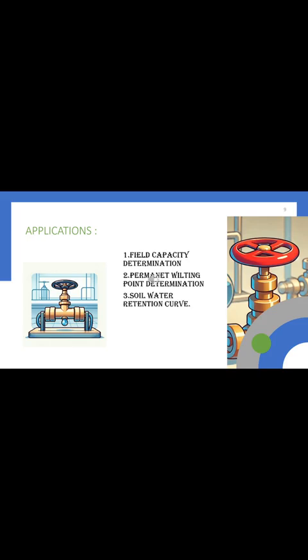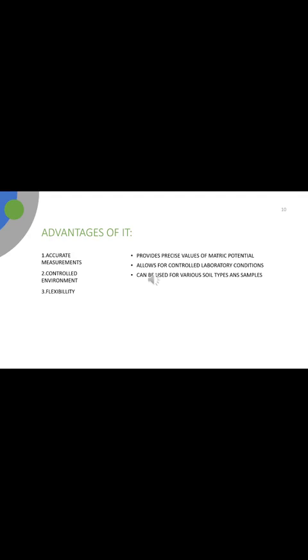Advantages of it are accurate measurements, controlled environment, and flexibility. It provides precise values of matric potential, allows for controlled laboratory conditions, and can be used for various soil types and samples.